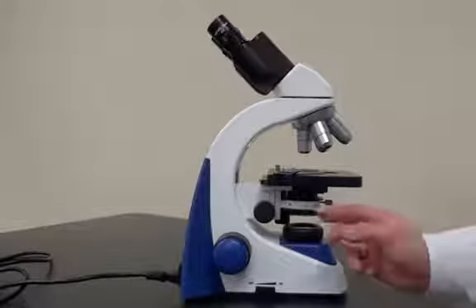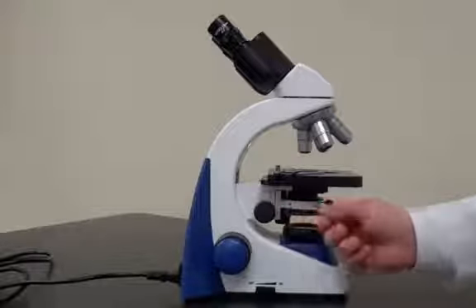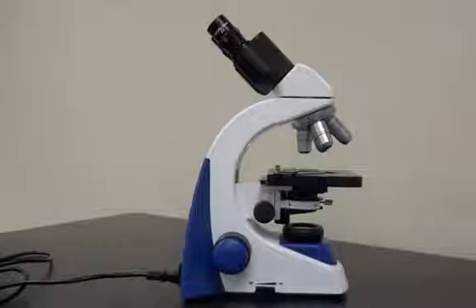Now we do have this little stage here. Sometimes there's a blue lens in there. If there is, you can take that out. We won't need that for any of our viewings.